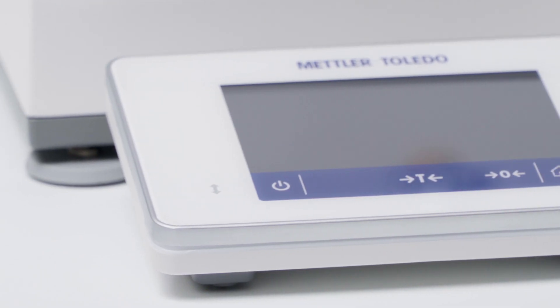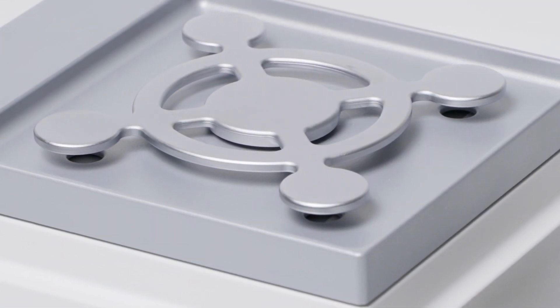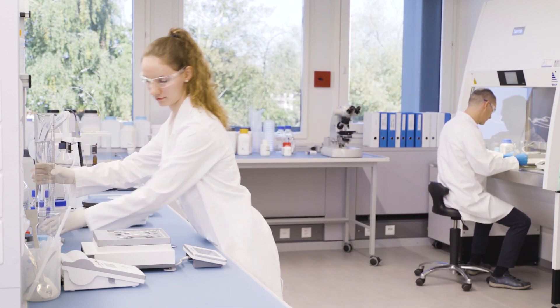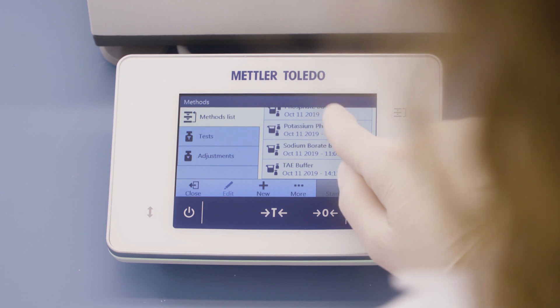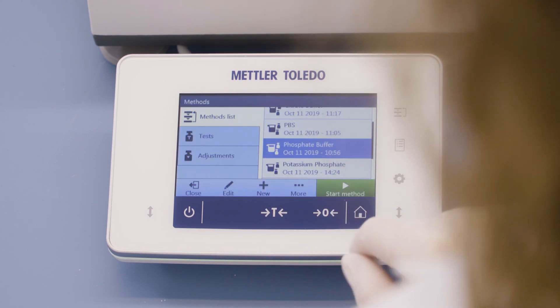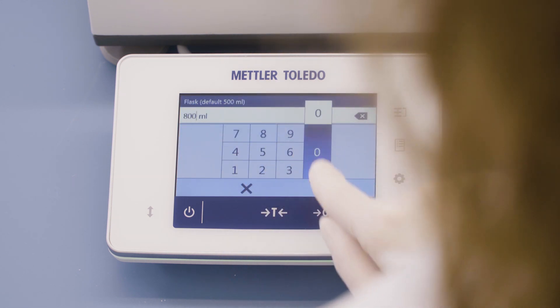Mettler Toledo instruments can help you ensure your buffer solutions are accurate and consistent. Buffer formulation recipes can be saved on the laboratory balance. Simply select the method, enter the required volume, and the ingredient amounts are recalculated automatically.